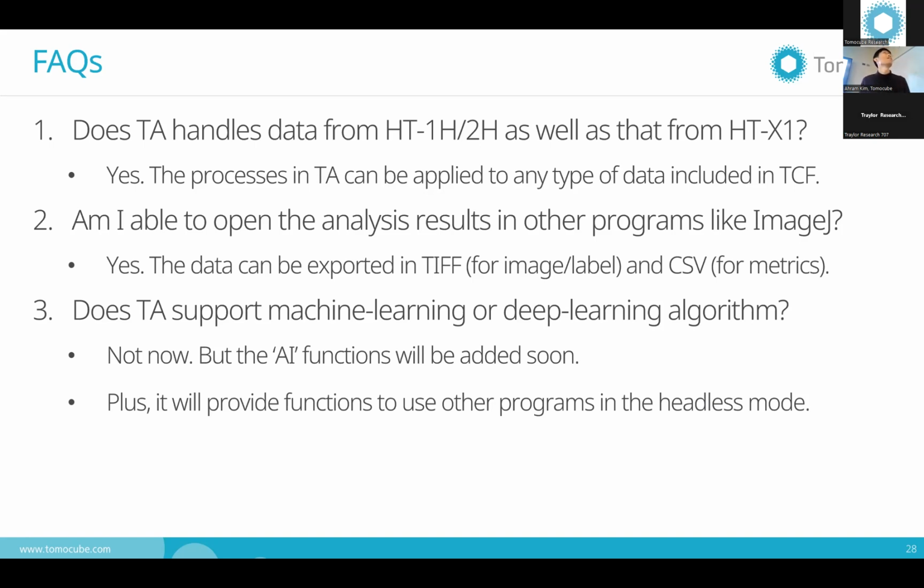Tissue models are also applied with this HT. For the segmentation, tissue is somewhat up, somewhat down. So do you also do 3D segmentation for those things? Yes, that's a very nice topic that TomoAnalysis wants to address.